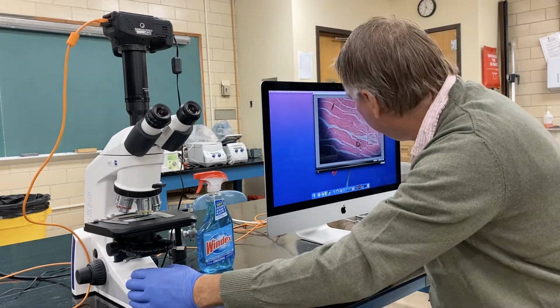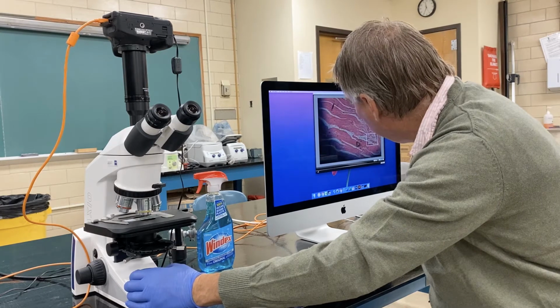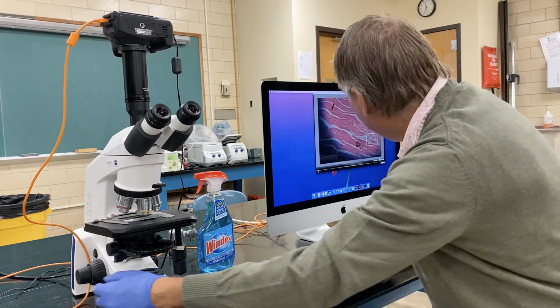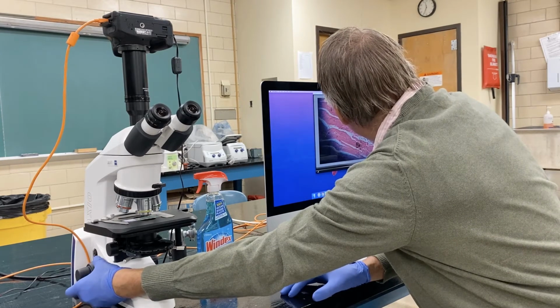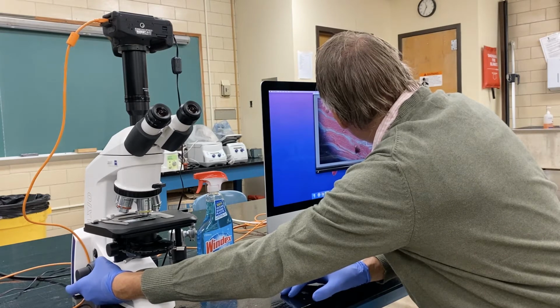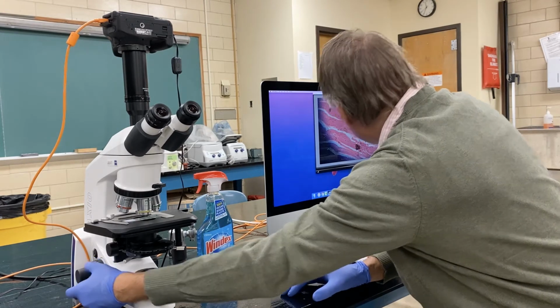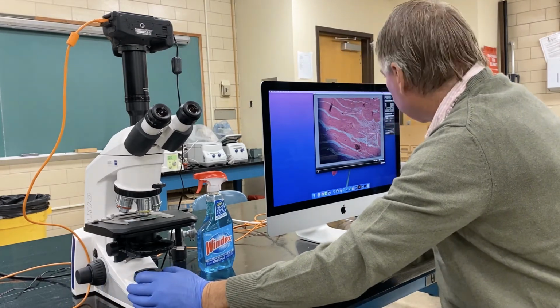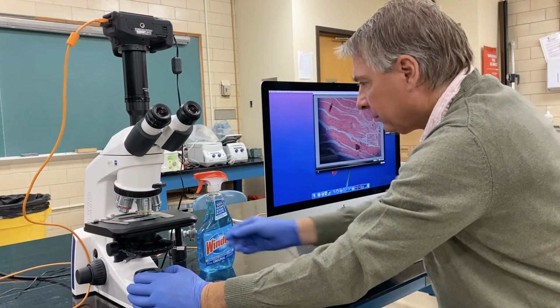I'm going to close the field diaphragm a little bit more, and again, I'm going to try to focus my sample a little bit here. Okay.